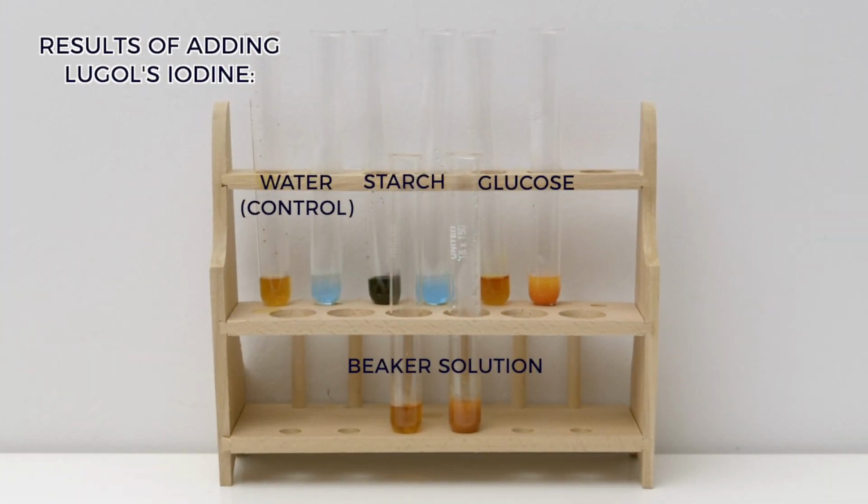After adding the iodine to the test tubes with the 4 different liquids, we observed that the first test tube with water turned amber, the second test tube with starch immediately changed color to blue-black, the third test tube with glucose turned amber, and the last test tube turned to a more pronounced amber.